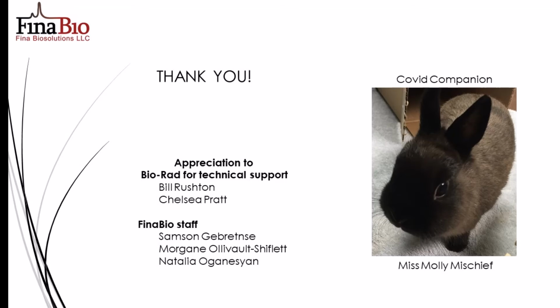The main consideration is to keep the process as simple as possible. We want to minimize the number of steps, and we want to minimize the amount of processing between steps. So we want to be able to load directly from the eluent from one column onto the next column. And as you can tell from the process we developed, we went right from the eluent from the anion exchange column right onto the HIC column. So that saved having to do any TFF steps. Other considerations are trying to achieve high loading capacity and high flow rates. And the newer generation resins like the Nuvia meet those requirements.